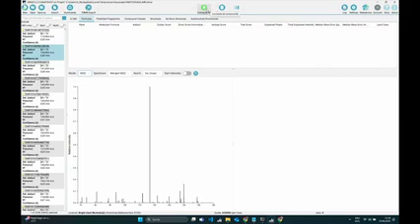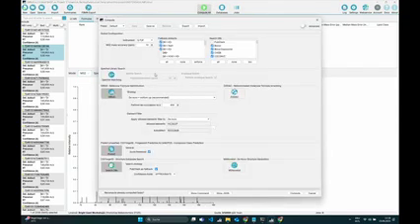So let's do this. This is one of the most important buttons here, this compute all button. And now, we already saw this in the presentation, this is the main computation dialog, where you have all the tools of the workflow. Markus already mentioned a few settings that might be interesting. So for example, in the top, you have these adducts, which you can change. Now, the important thing about this is we try to detect the adducts when we do the preprocessing, so when we input the data, and these adducts will only be taken as fallbacks if we haven't detected any adducts. But if you want to enforce them, there's also a button for this.